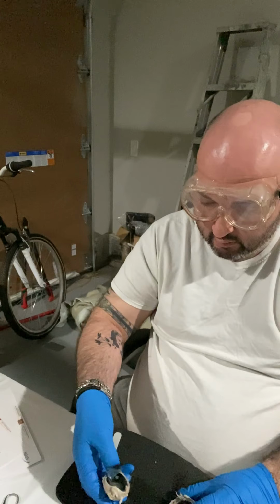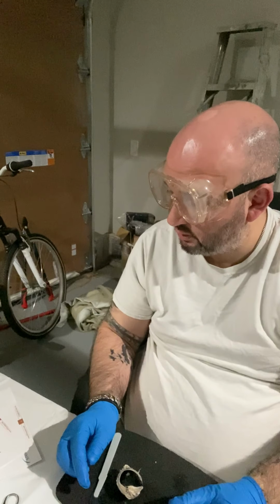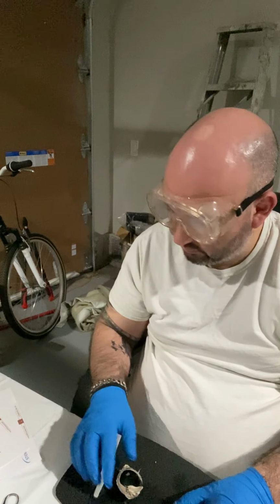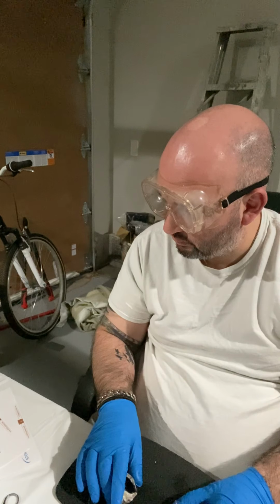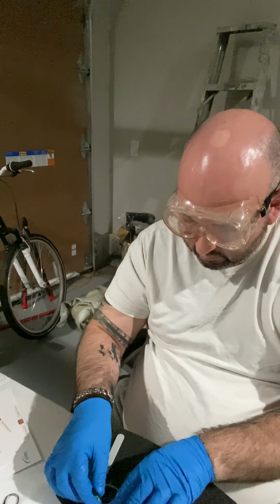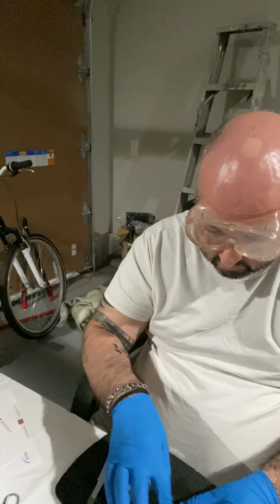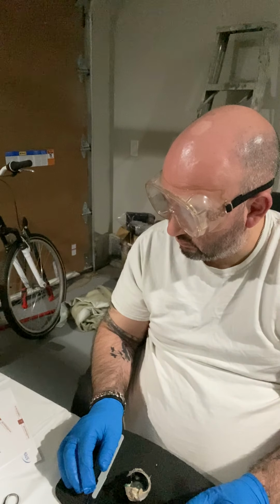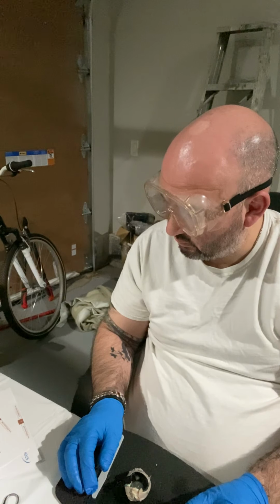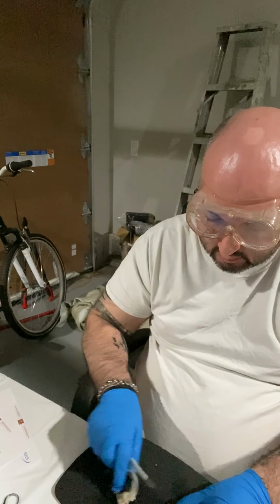Okay, so anterior, this portion here, is my posterior portion. And I'm just going to make an additional cut here, kind of towards the back.